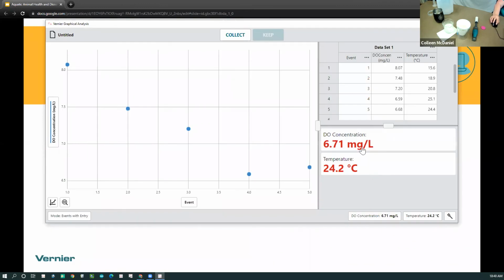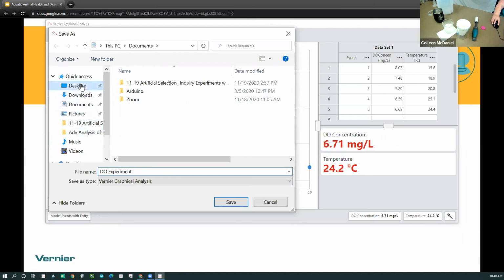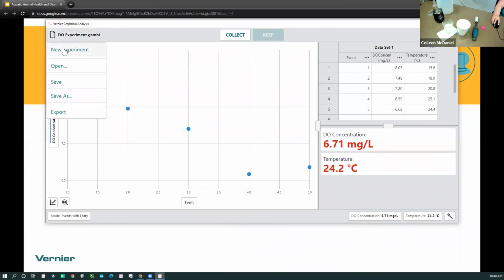Now, once you have entered that code into your graphical analysis, what you want to do is, hold on, let me save this onto the desktop. When you go to new, well, let me first activate a sharing session.